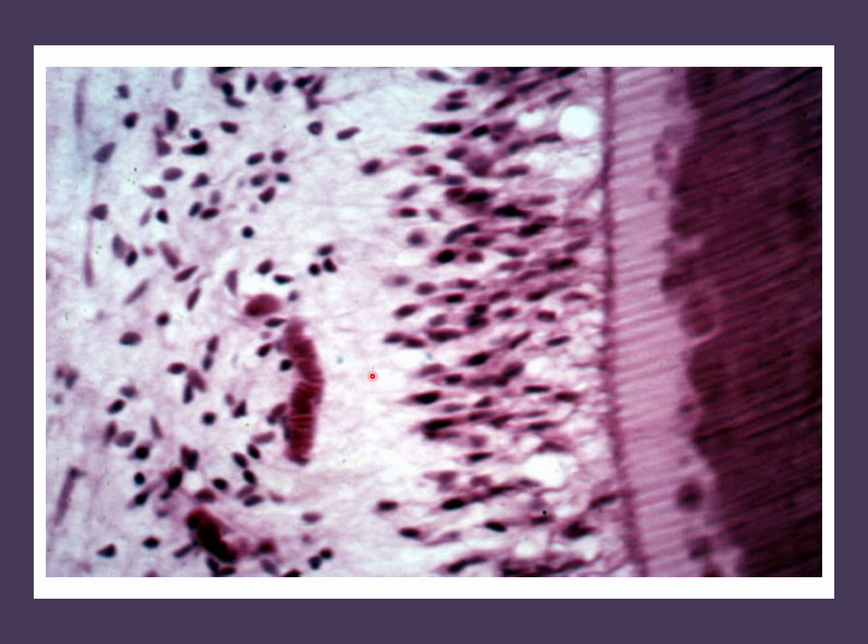But there are a lot of cell processes here, and we have discussed in the theoretical lecture that maybe it is because of shrinkage upon preparation of the section, the cells shrink and go down to this area. That's why this place looks free, and we can see it only in the crown. It's not found in the root area.